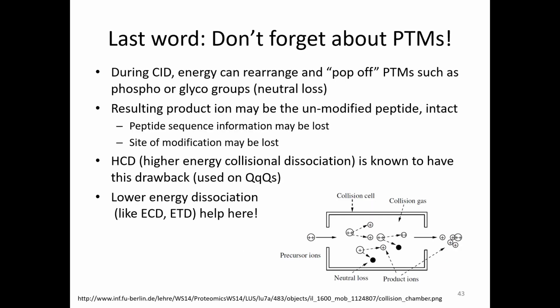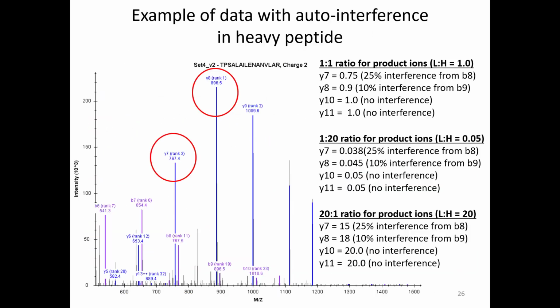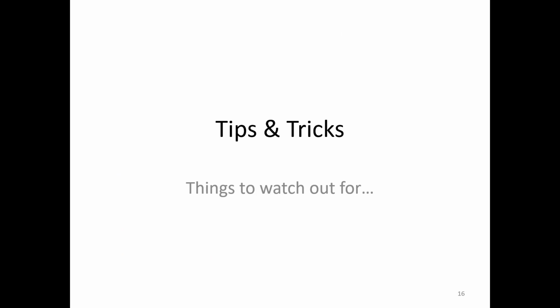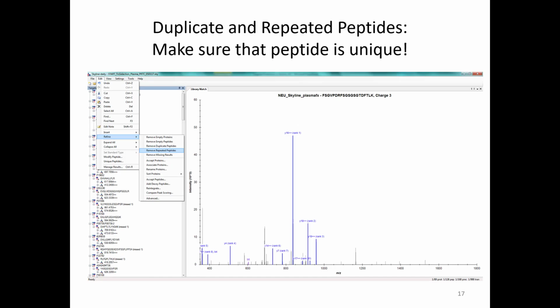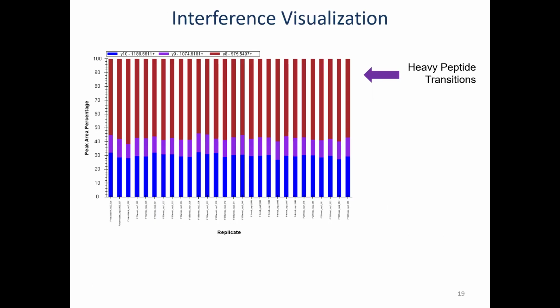Worry about interferences. This was one thing I kind of hopped over in this presentation. Early on, we asked Brendan if there was a way to see if there were interferences in our signal, because we're measuring parts of our peptide, and there are lots of other parts of other peptides that can interfere with the signal. One of the things you can do in Skyline is look at the peak area view, right-click, and normalize to total.